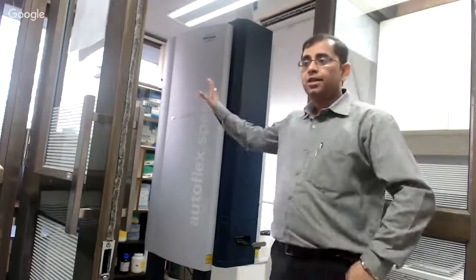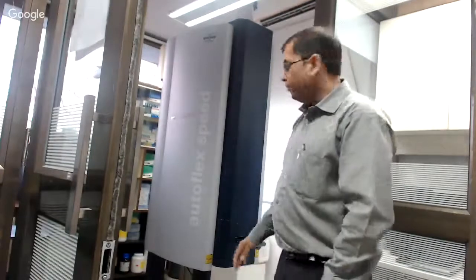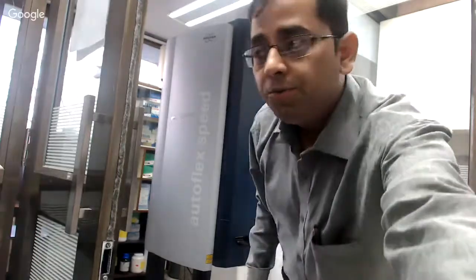When you want to analyze any of your protein samples in MALDI, first of all you have to crystallize them, because you have to do laser desorption ionization. To do that, you add certain matrices and make solid crystals, and those crystals are then put inside this instrument. Right now I'm standing in front of this MALDI-TOF instrument, and I can take the camera to show you this plate area in more detail. Here, we can insert the plate. Can I get a plate?